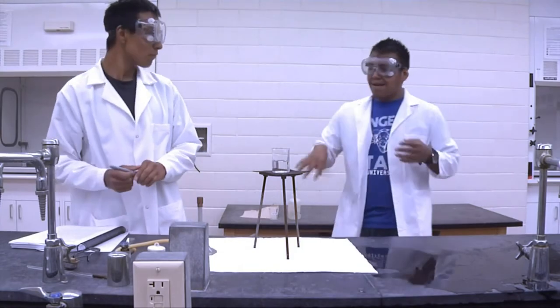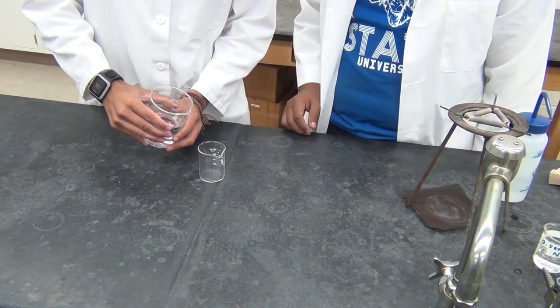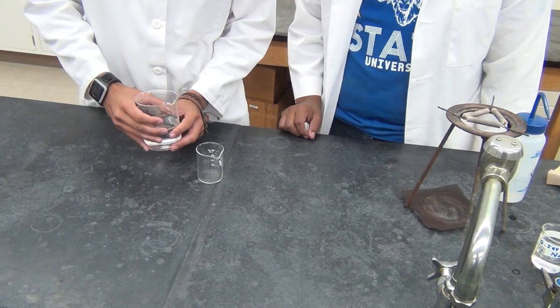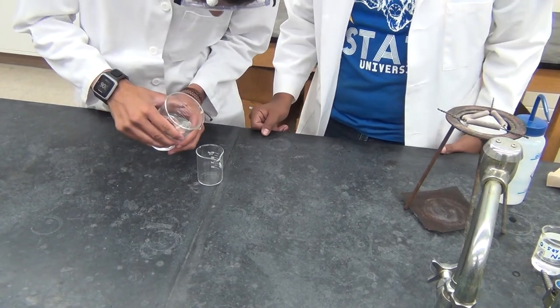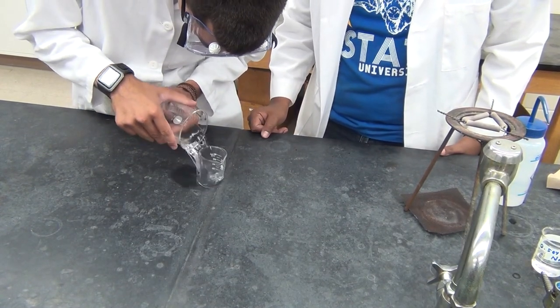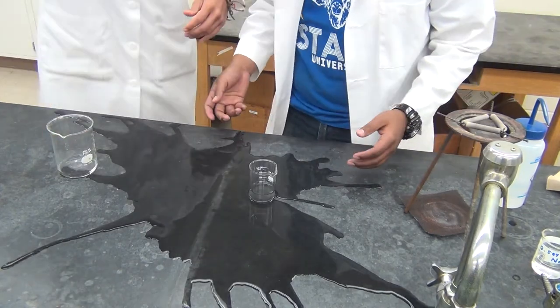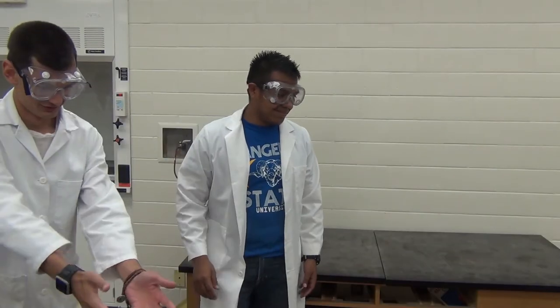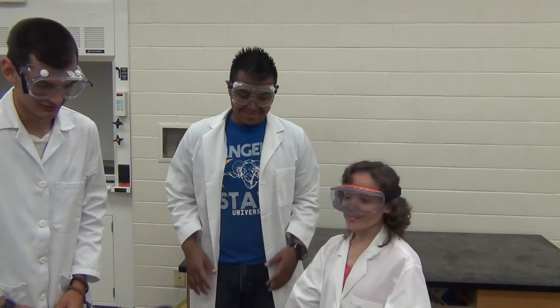Notify the lab instructor of any spills which occur during the lab. Minor spills can be cleaned up by students, but do not try to clean up reagent or solvent spills yourself. Some of these materials require special care in their disposal. Clean up any spills immediately.